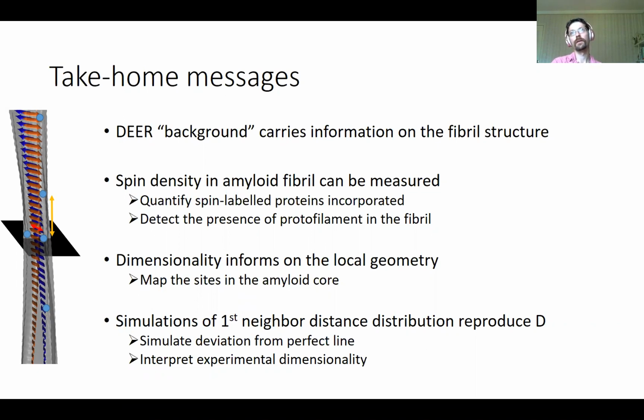First of all, you can easily, not even simulate, but just add the equation for 3D and the equation for 1D. If you have a mixture of both 1D and 3D, the signal is different, the shape is different, and you can no longer fit it like this.